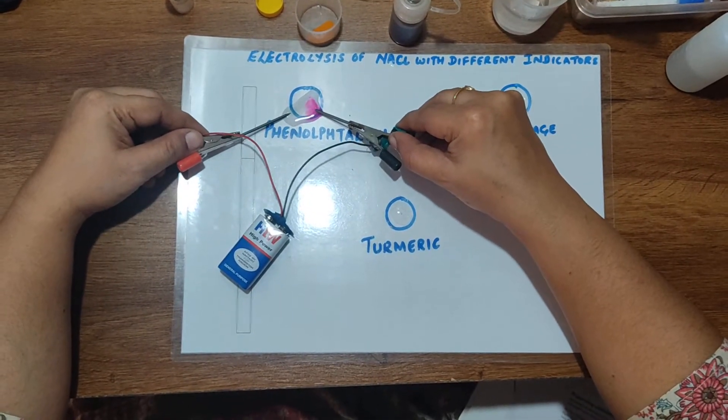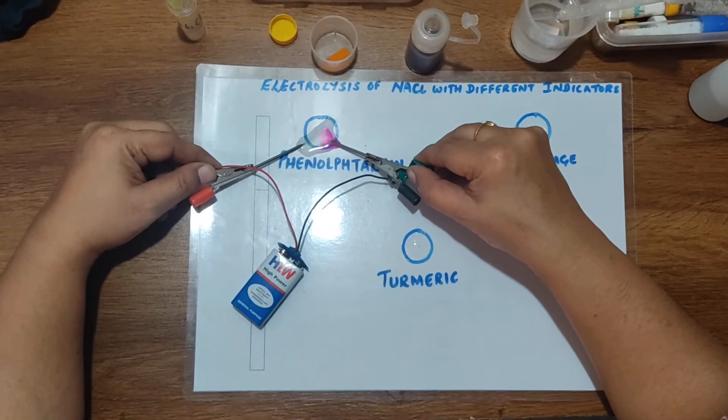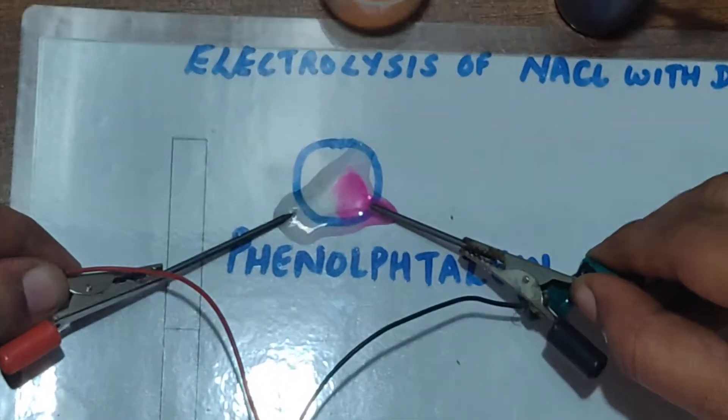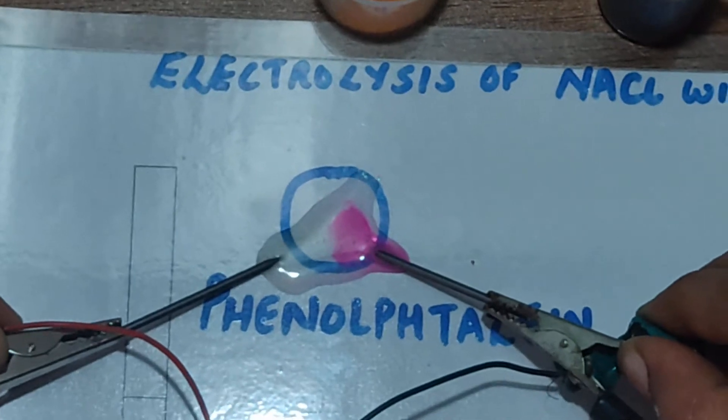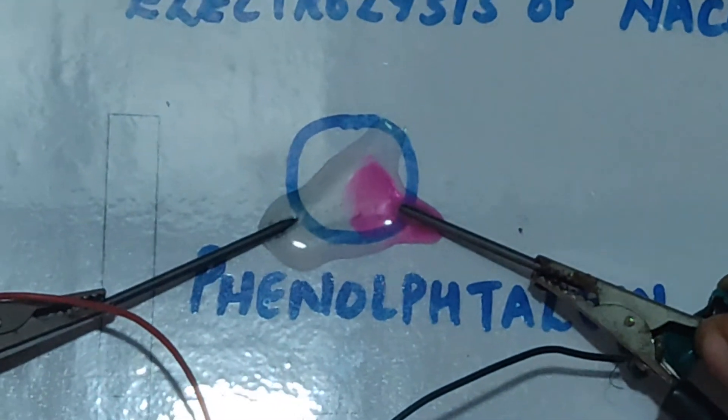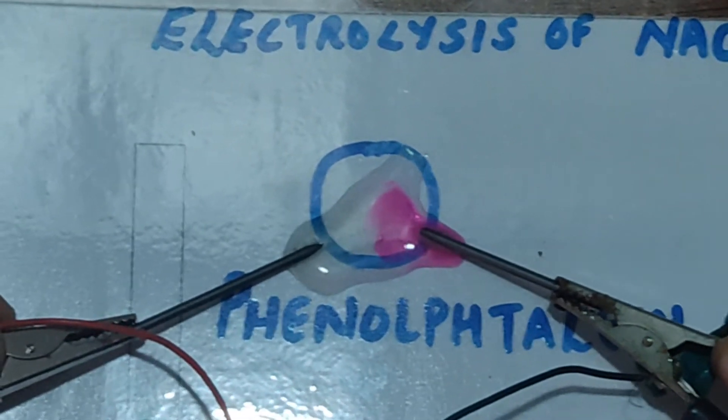At the positive electrode or anode, oxidation takes place. Chloride ions are oxidized to chlorine gas. You can see the small bubbles even at the positive electrode. The reaction remains the same irrespective of the indicators used.